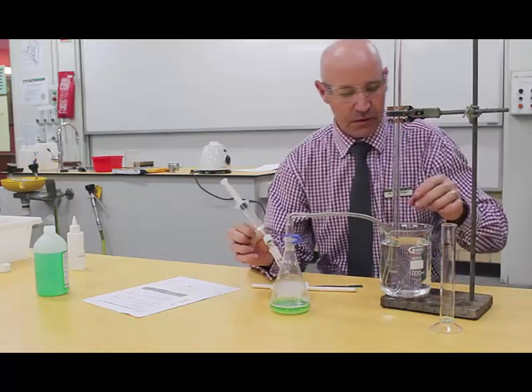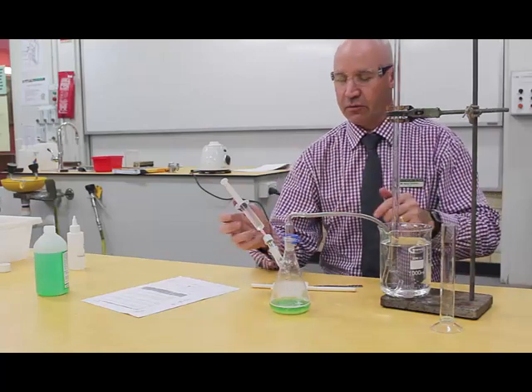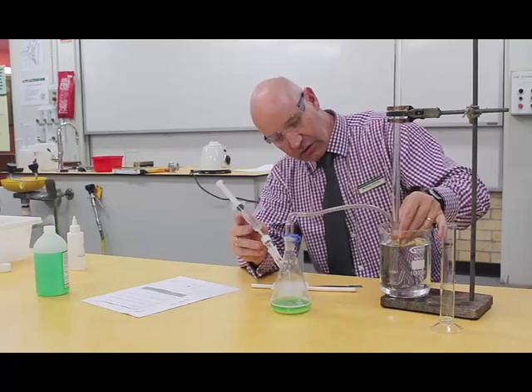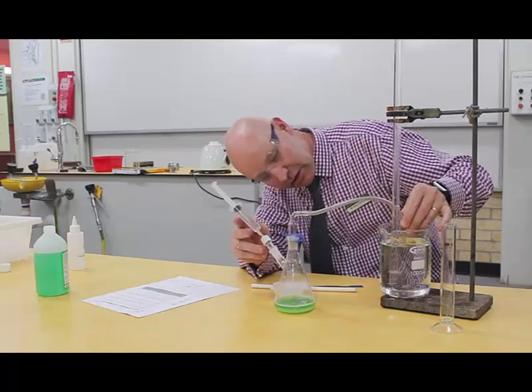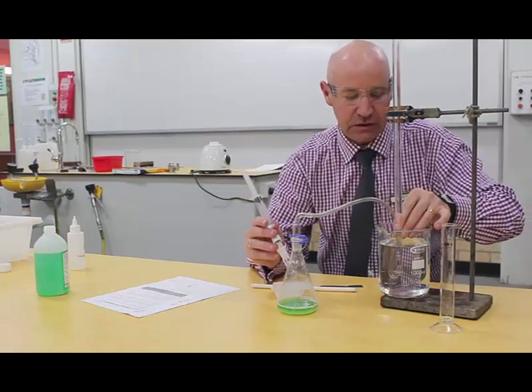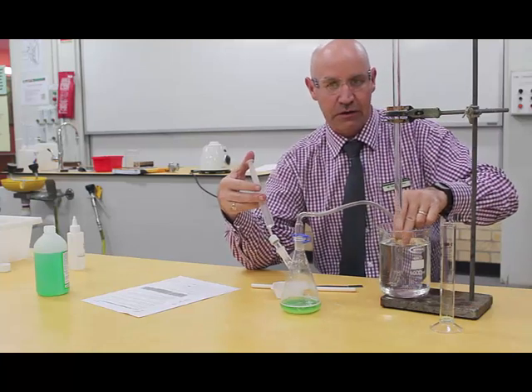Okay, I think I'm ready to go. So we will start our stopwatch as soon as I push this in, and then I'm going to position the tube inside the neck of our measuring cylinder like that. Okay, so I'll get my helper to start the stopwatch.